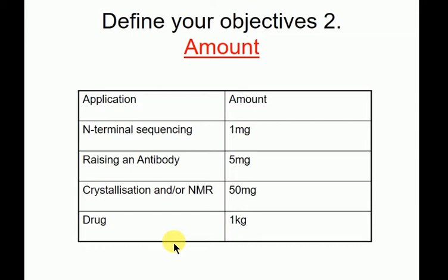For structural studies, it helps if you have a high number of mgs. And then coming back to therapeutics that are going to be made by companies, it's going to do them no good unless they're able to get kilo amounts of a protein to bring to markets, which is why you see so many fermentation setups to produce huge amounts of therapeutic protein.